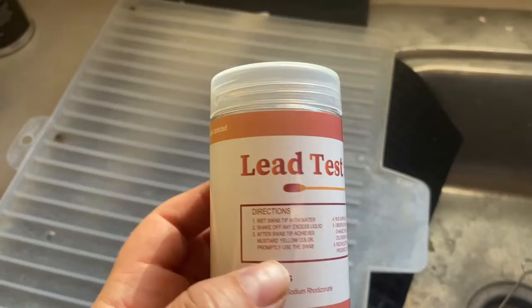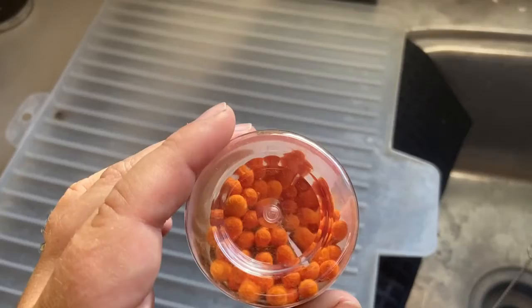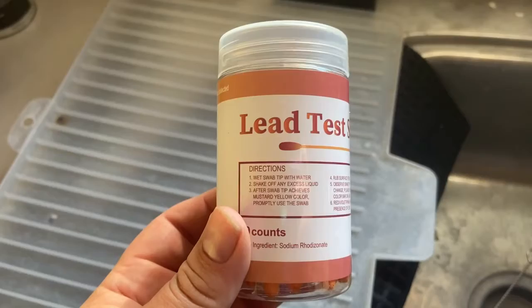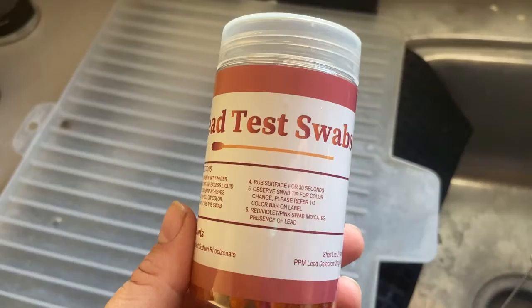I got this kit on Amazon. It had mixed reviews — some said you couldn't really read the results. It was pretty cheap, and I have a ton of places to test, which is why I wanted this kit because it has a ton of swabs. It says to wet the swabs, shake off the excess liquid, then rub the site for 30 seconds and observe the tip color change. I'm going to refer to the label.